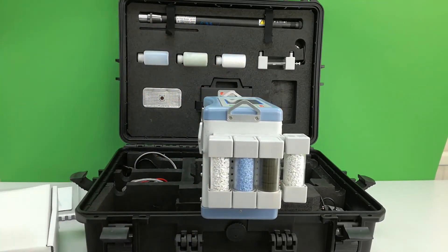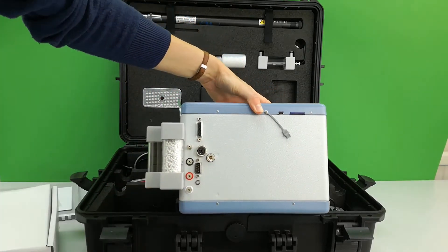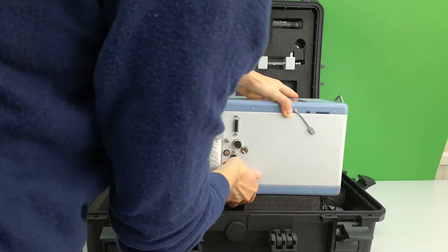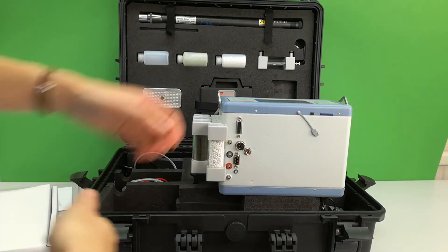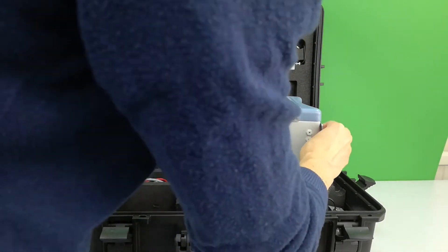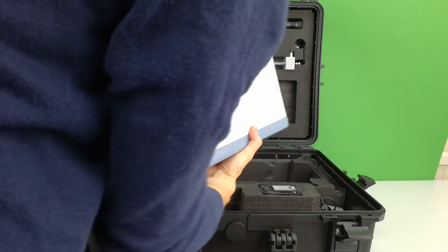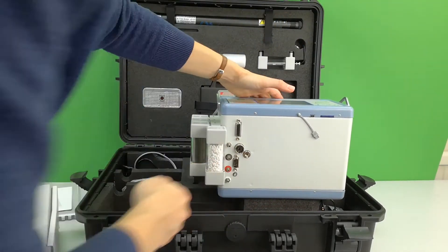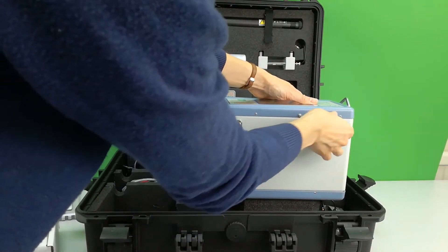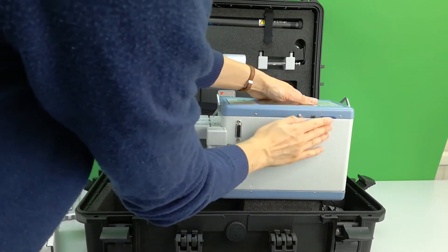On the back are all the gas and electrical connections, SD card slot and USB port. Handles attach like so for a carry handle to wear either around the waist or the shoulders for comfort. The SD card slots in like so. The console acts as a data logger.